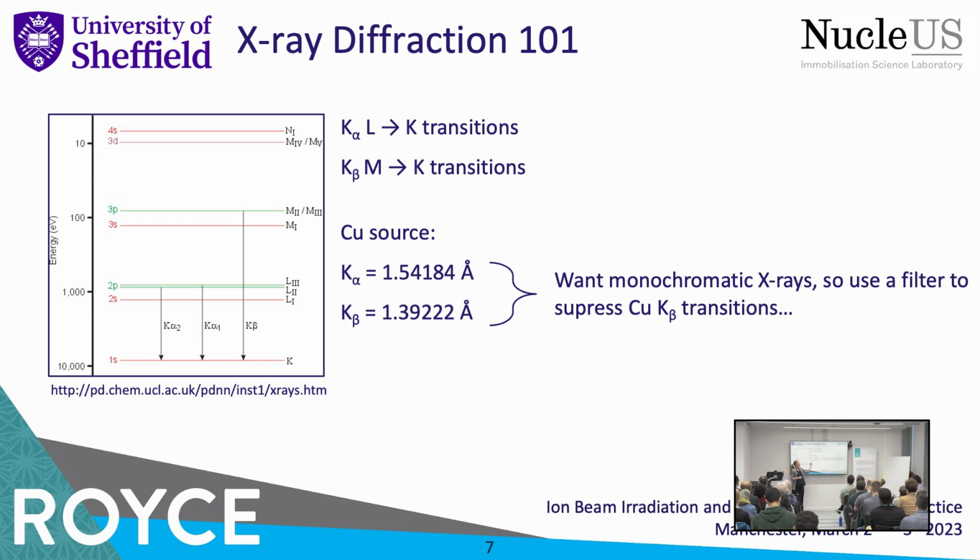It doesn't fully remove K beta. There's always a little bit there, and that's something to consider if you're doing some really high resolution XRD. But for what we're doing, that's fine.